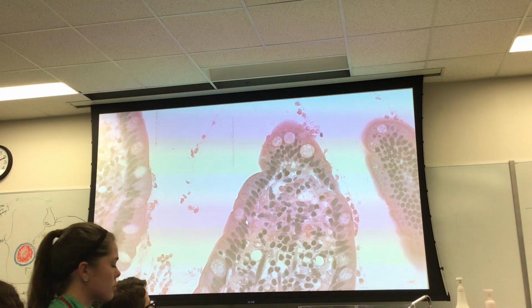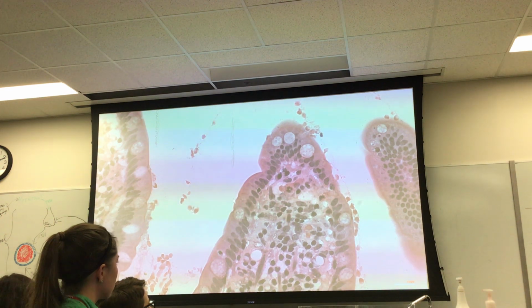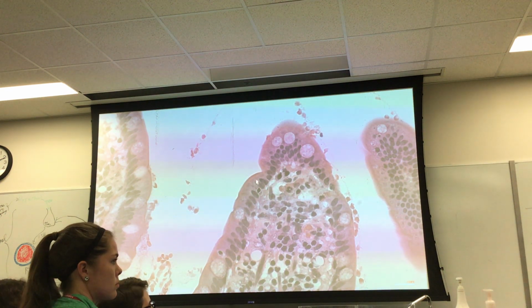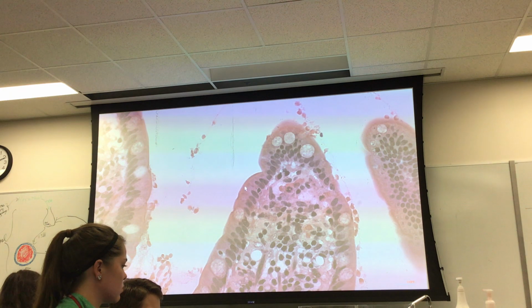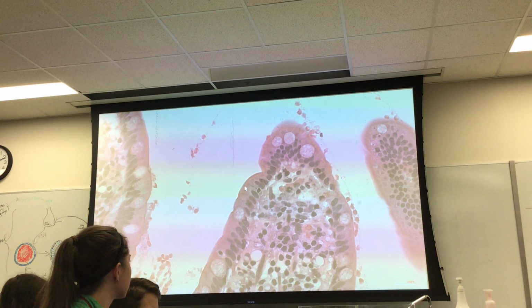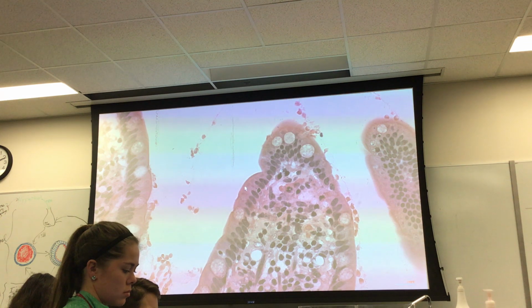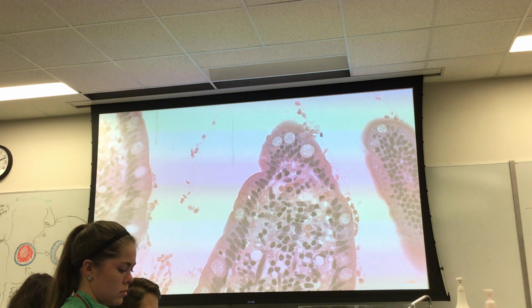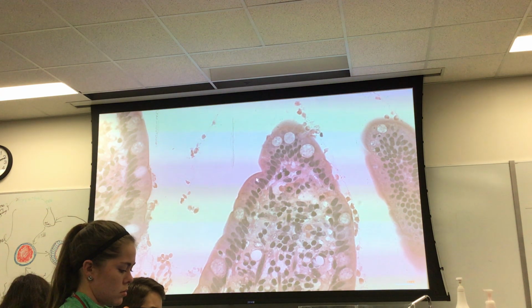No, it's not pseudostratified. You know why? Because first of all, it really does look simple columnar right here, which it is. And also, this red line along the surface, what do those represent? Is that cilia? Or in fact, is it microvilli? So this is an example of where you can have a simple columnar epithelium with goblet cells. But the key feature is, remember we said if it's pseudostratified, you've got to have ciliated cells. These are not ciliated cells. Instead, you have this red line that's called the striated border.